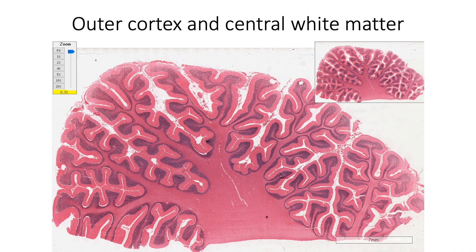Cerebellum shows an outer convoluted cortex containing neurons and a central core of white matter containing ascending and descending fibers.